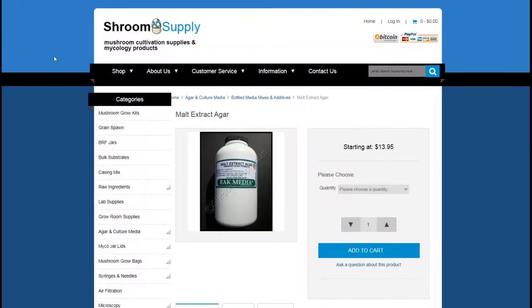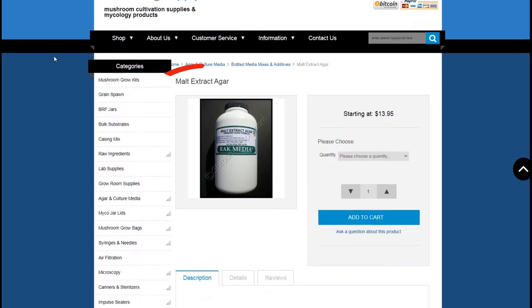We recommend working with a pre-mixed enriched malt extract agar, which is antibiotic free, but you can always experiment with your own amendments to the agar.